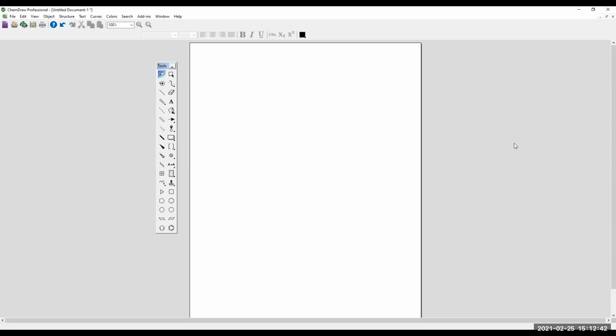If you're in the physical library spaces, we have ChemDraw 17. They come out with a new edition pretty much every year. There's not a whole lot of differences, just some buttons moved around here or there, but most of the features in between those are pretty much the same.